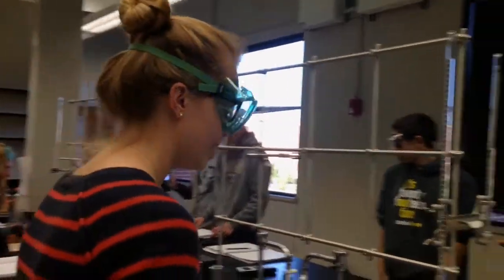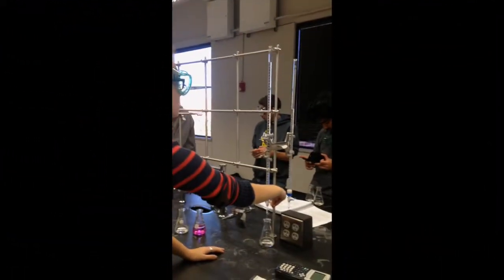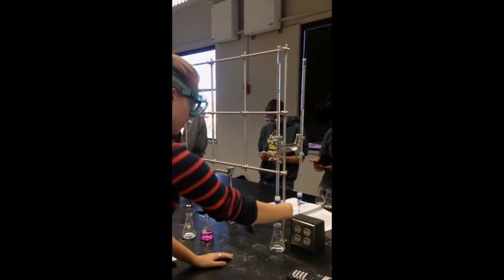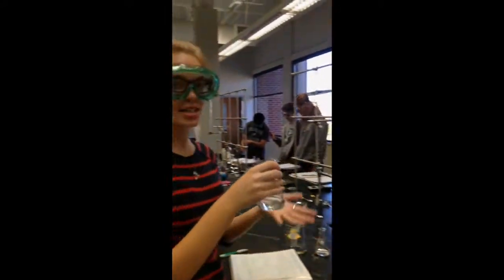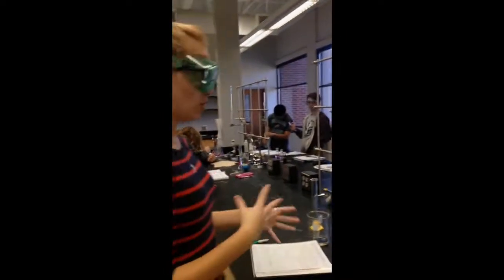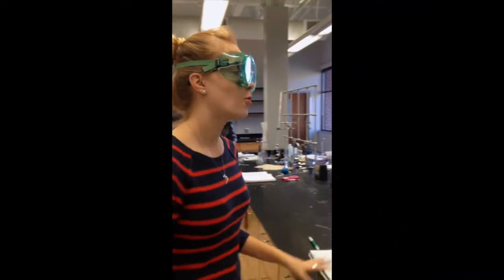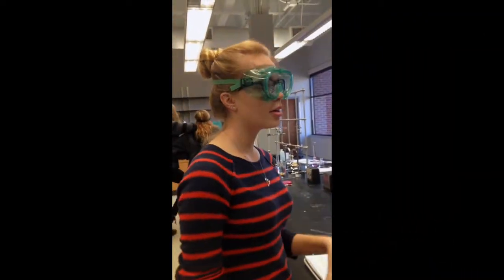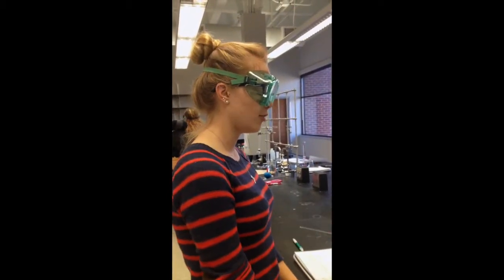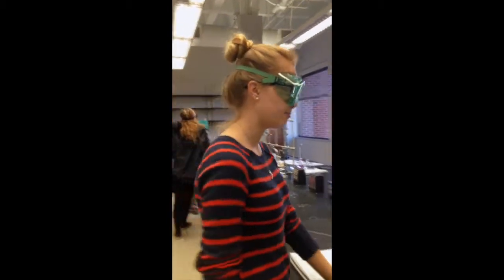Okay, so now I'm going to release 1 milliliter of this solution here, and I'll start the titration. So here we see nothing happened yet, but each time you want to make sure you swirl the flask so you know that all of the NaOH is mixing with all the KHP solution. Okay, so now we used around 25 milliliters, and we know the equivalence point is somewhere around 30, so we're going to let the NaOH out very slowly until we see a faint pink color.